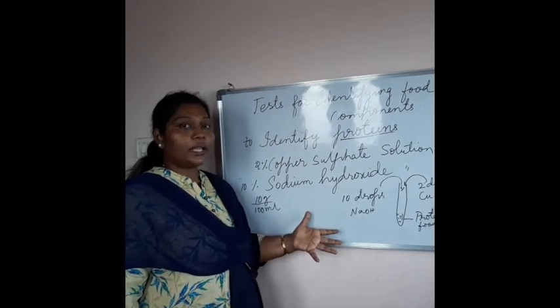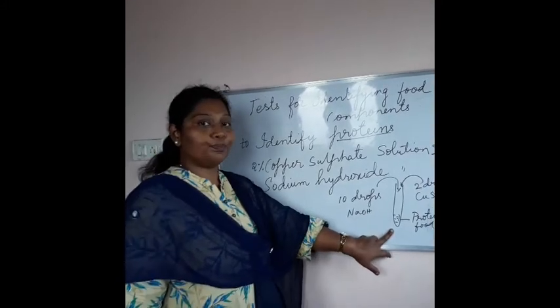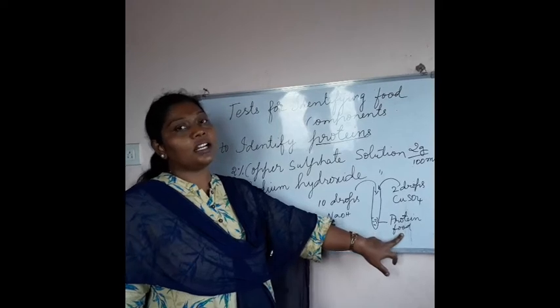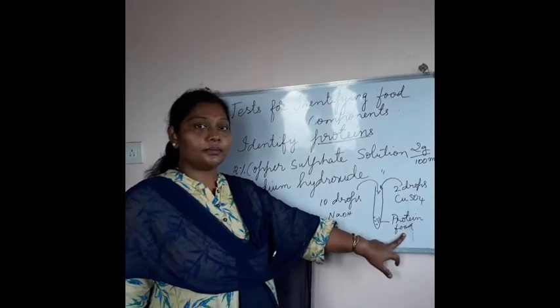Now, you can take a clean test tube, and to this you can add any protein containing food. Okay, children.